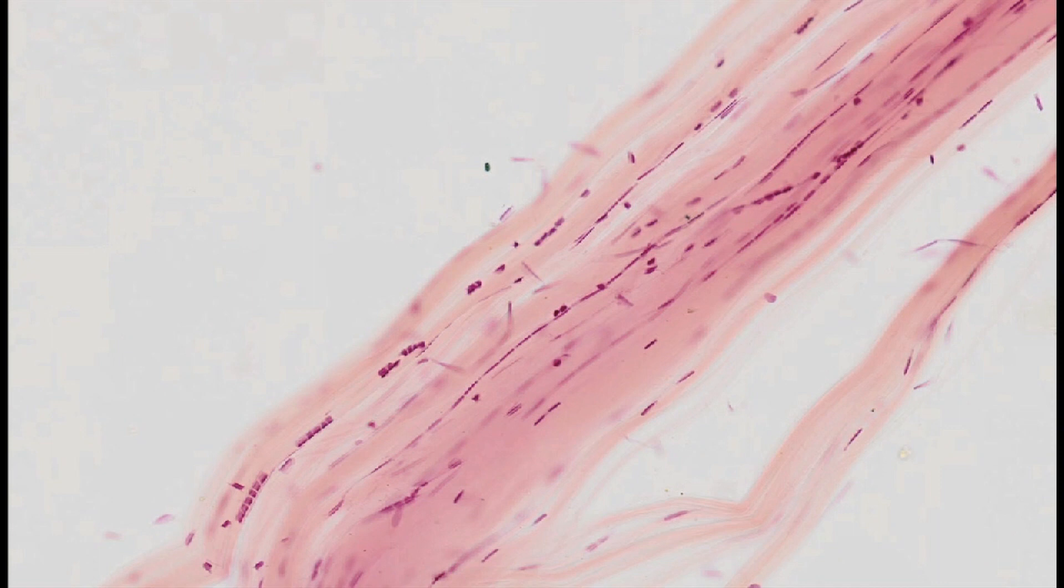This type of tissue is dominated by intercellular substance in the form of type 1 and 5 collagen fibers with high tensile strength.